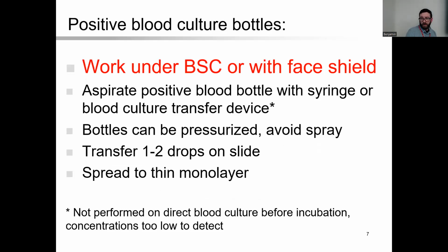Positive blood culture bottles. This again, it's direct patient specimen, so we're going to do this under the BSC or with the face shield. We're going to use a syringe or a blood culture transfer device to remove a drop of blood from the bottle. Don't do this right when you get the bottle in the lab. It hasn't been incubating long enough. You're not going to see anything in there.